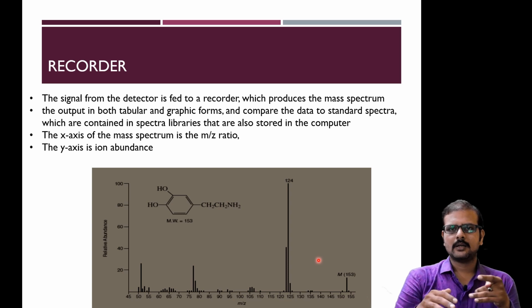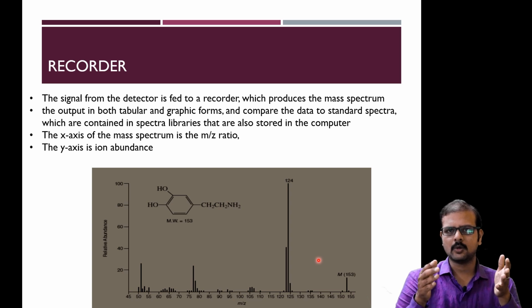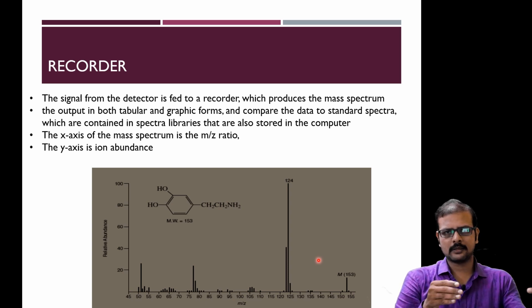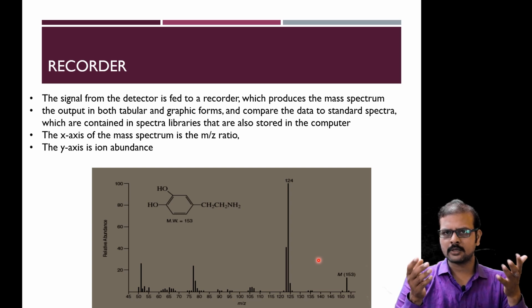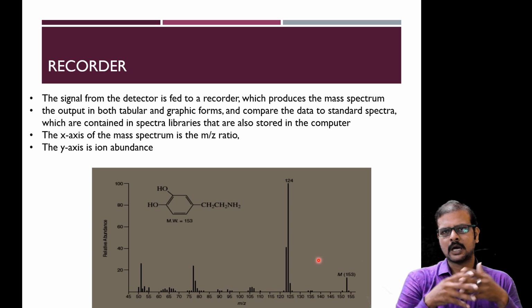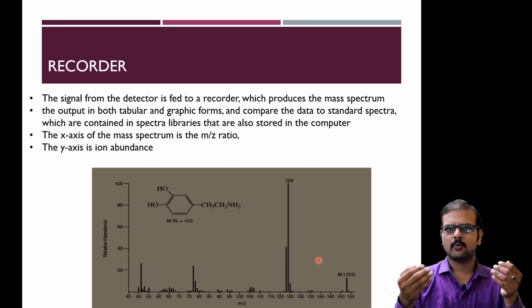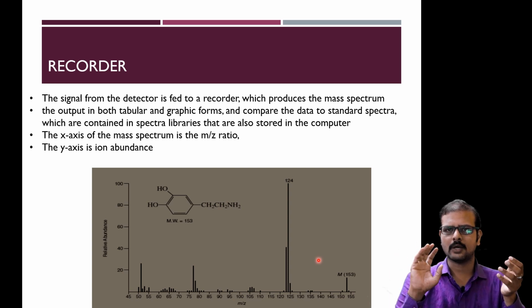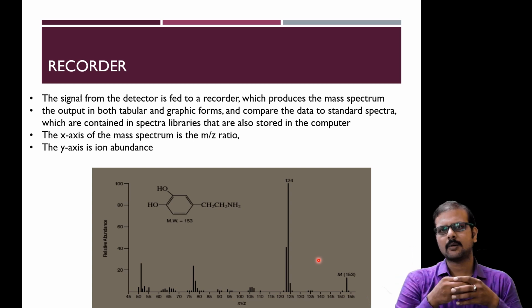So here we have to know that this mass spectroscopy, even though it is termed a spectroscopy, is not a spectroscopic method. Why? In the whole process we have seen now, we did not use any light spectrum, or any RF method to detect the compound. But in spectroscopy, what we do is we pass an EMR, that is electromagnetic radiation, to find out the structure of the molecule.